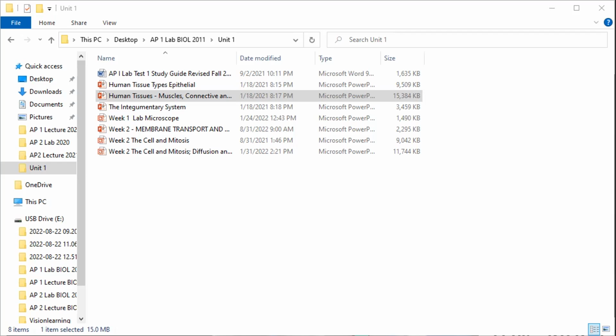There we have the dermis. We see hair follicles, sweat glands, oil glands, and blood vessels. When you cut yourself and you're bleeding, the only way that you bleed is if the injury penetrated the dermis. Now, we're not talking deep layers of skin here. But if we're bleeding, we penetrated to the dermis. If we're not bleeding, then we didn't get down that far.